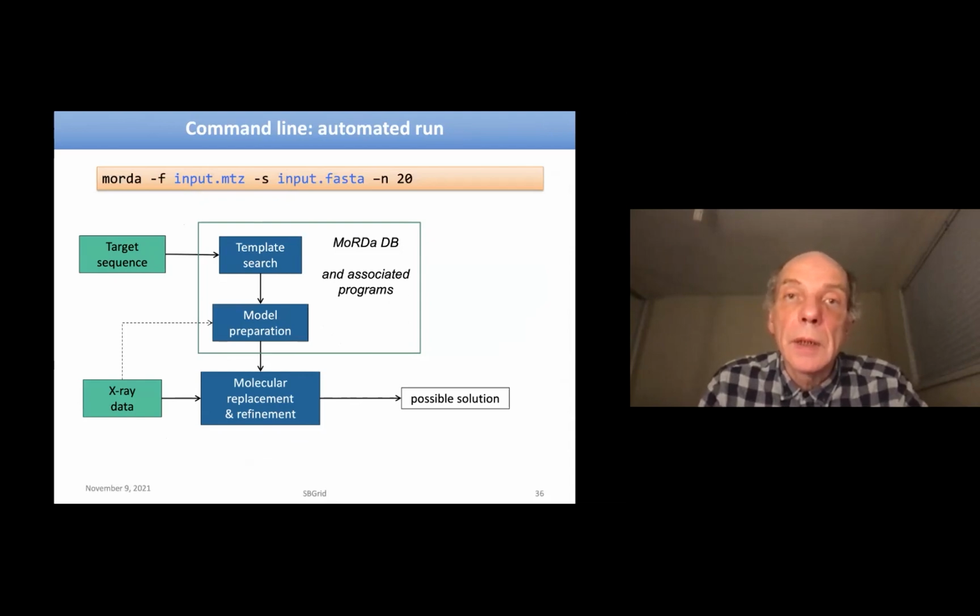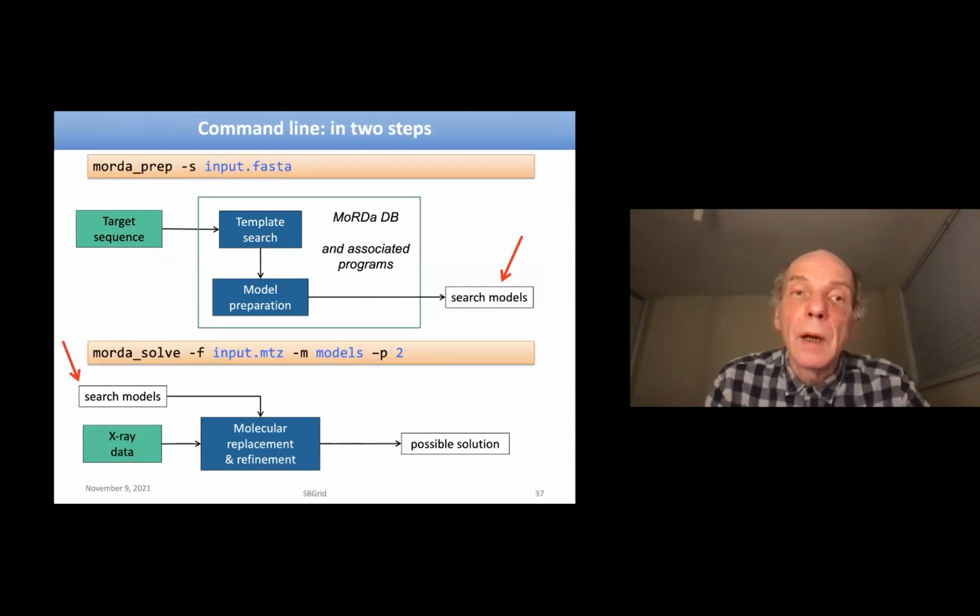Right, nonetheless, MoRDa is also a command line tool. You can run it like shown here in the orange box, and it will do the same job, except that it won't be parallel as on the server. But also, and this is why it's interesting, with this command line option you can perform two parts of the structure solution process separately.